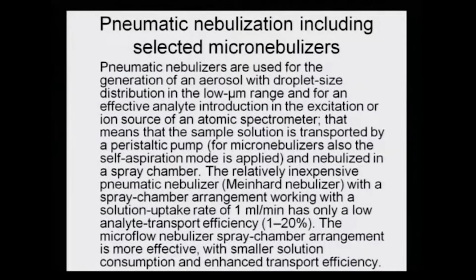That means the sample solution is transported by a peristaltic pump, and for the micro nebulizer also, the self aspiration mode is applied. So, it sucks on its own. There is self aspiration and there is this peristaltic pump which pushes the solution more towards the nebulizer. Then it is nebulized in the spray chamber. So, it does not get wasted, there is a proper glass spray chamber within which the aerosol forms.